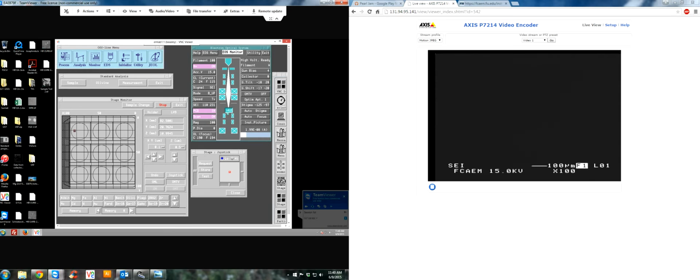So let's turn the scan generator on, and let's find the sample. Conveniently, olivine is right here, okay? But in case you don't know where it is, let's move the stage away for a second. Okay. So initially you might find yourself somewhere around here. So just drive around until you find the olivine standard.